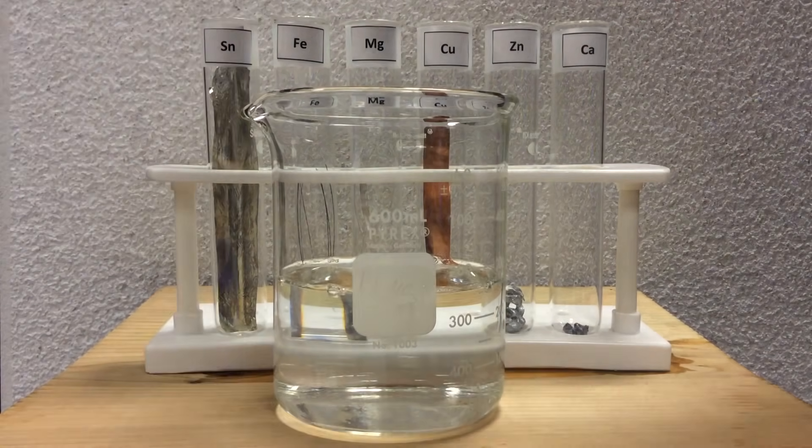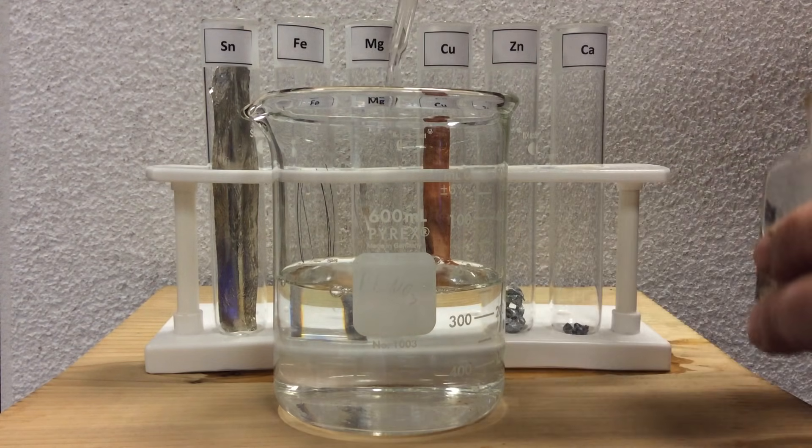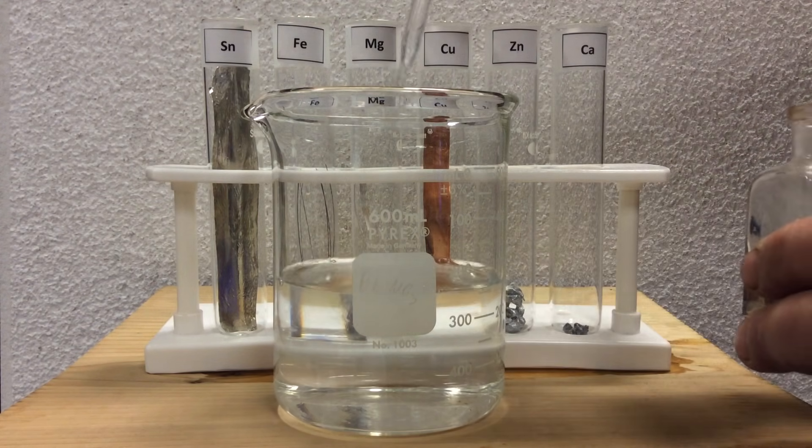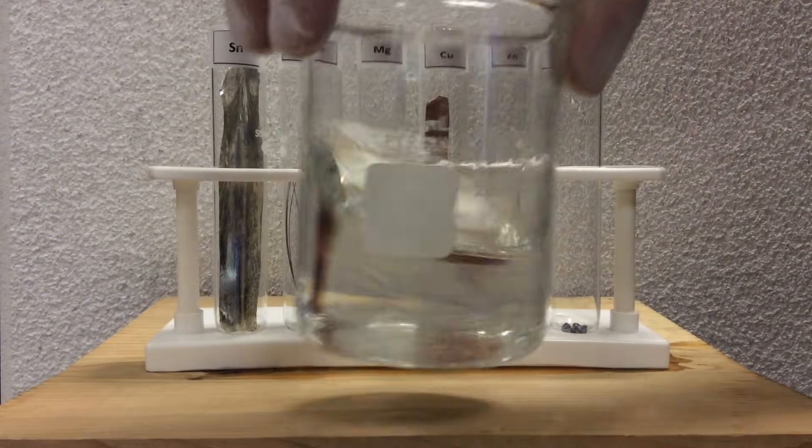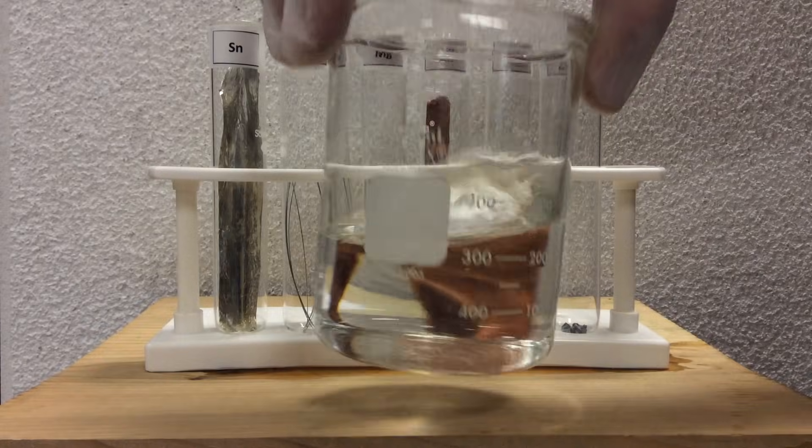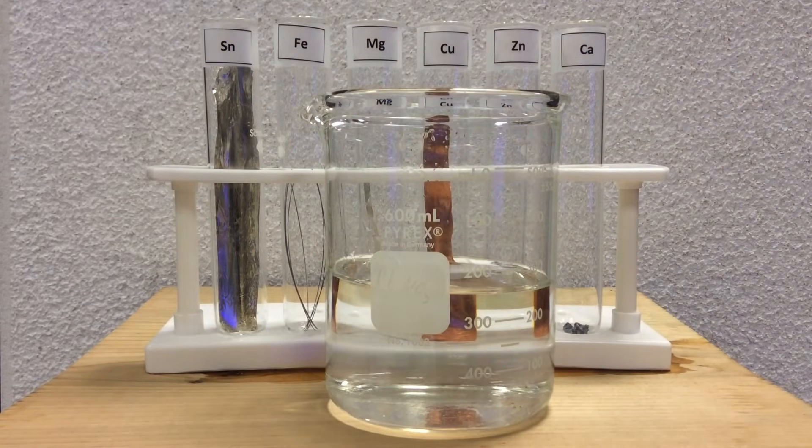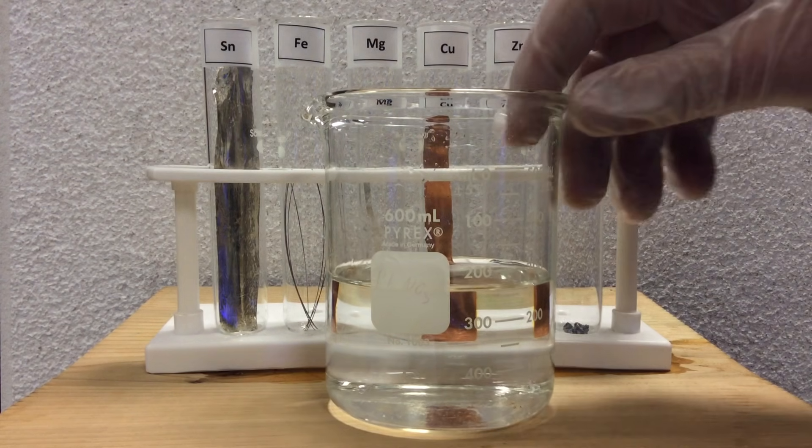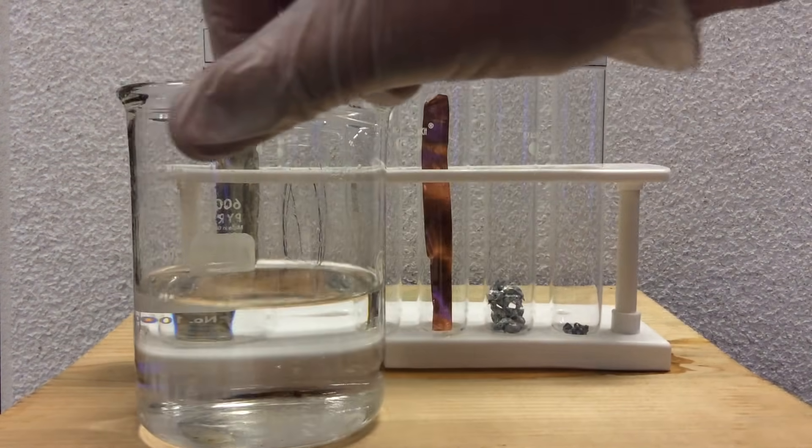So we're looking here for bubbles, visible identification that a gas has been made. And we're looking for the presence of a pink compound as phenolphthalein changes its shape in the presence of a base solution so that it can absorb wavelengths of light in the pink or red.